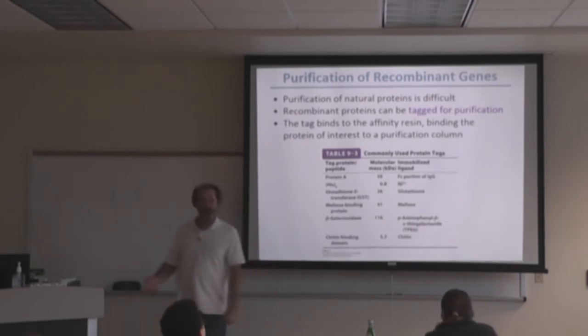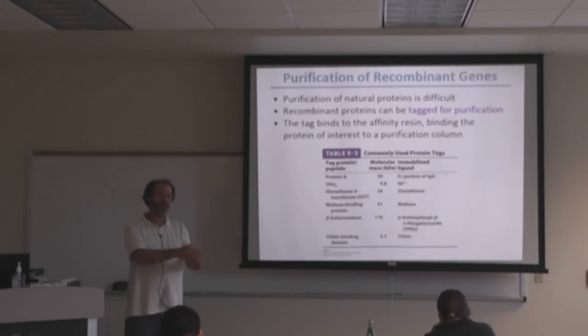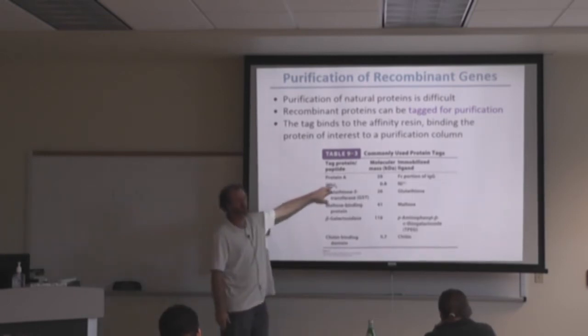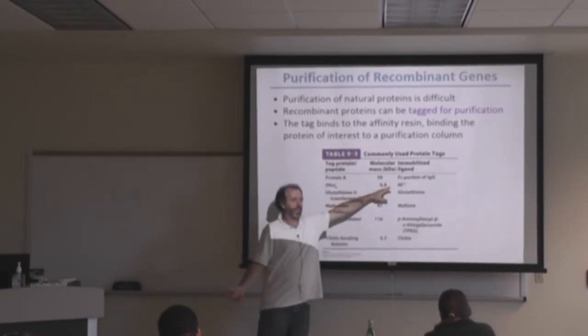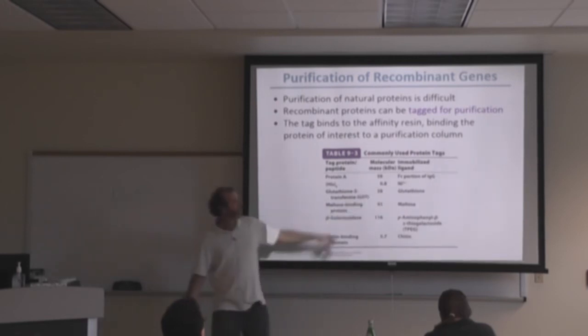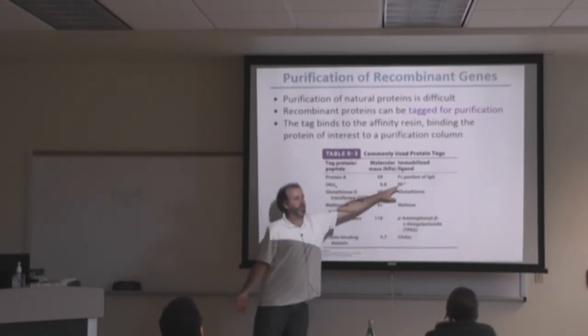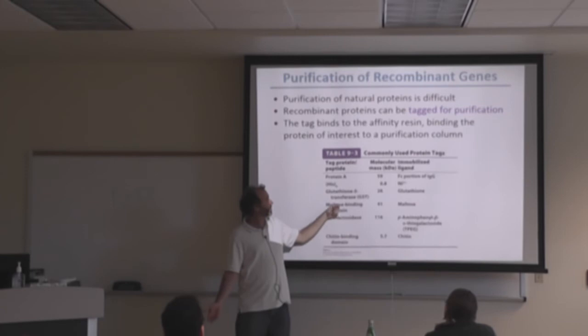An easy way to elute that is to change the mobile phase from whatever buffer you're using that had your mixture of proteins in, to a buffer that has a high concentration of imidazole. The imidazole will bind to the nickel and wash off your polyhis-labeled protein.